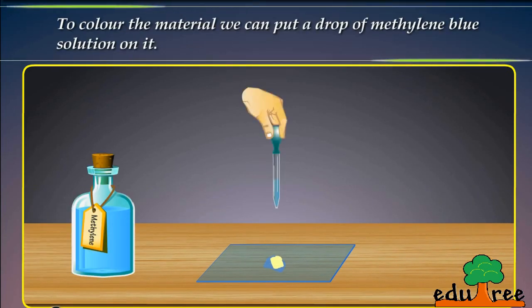To color the material, we can put a drop of methylene blue solution on it.